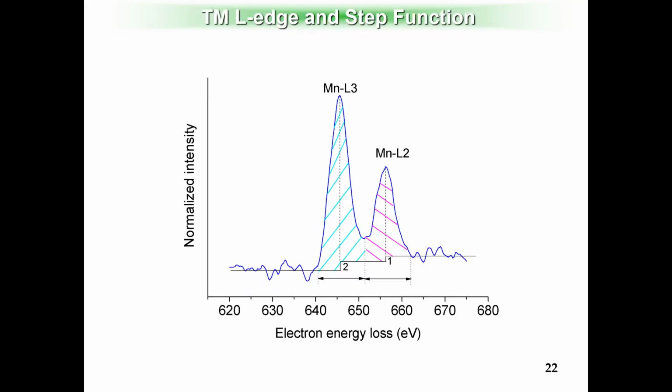So I have a quick question. For this, is it not possible to do what you do in XAS or XPS and just look at where the energies of the transitions lie, and at a higher oxidation state it will increase in energy? Yeah. So a lot of papers don't do this detailed quantification to claim the oxidation state, but they check what we call the shifting of the peaks in the energy value.